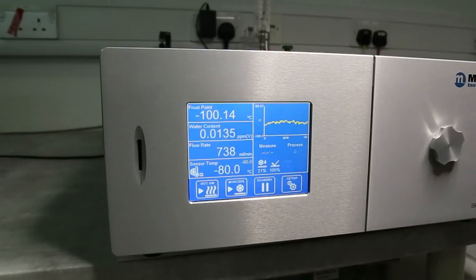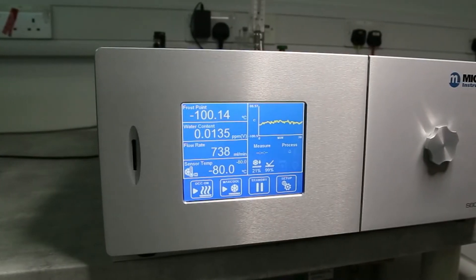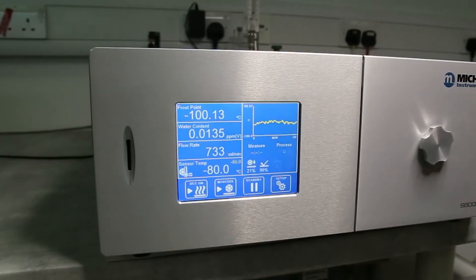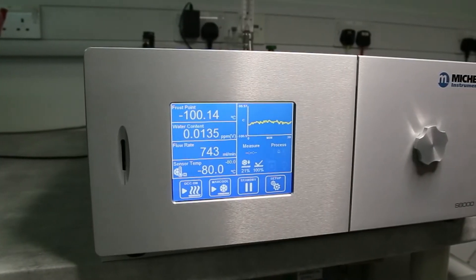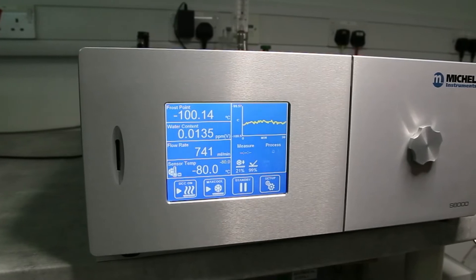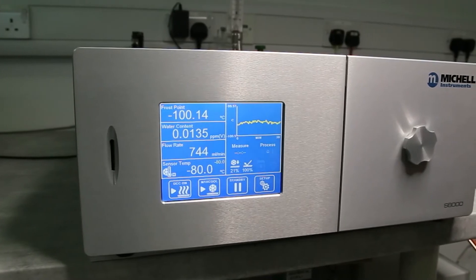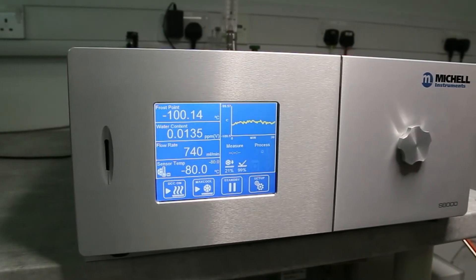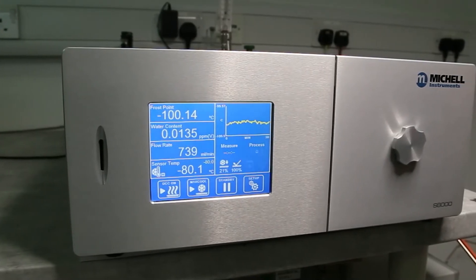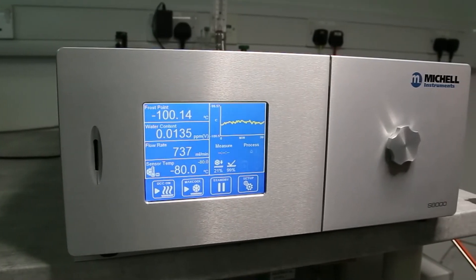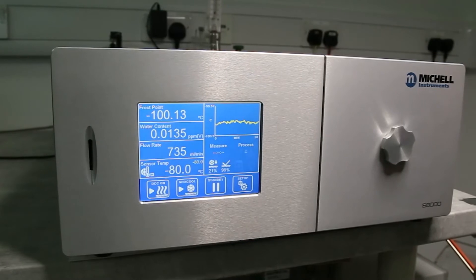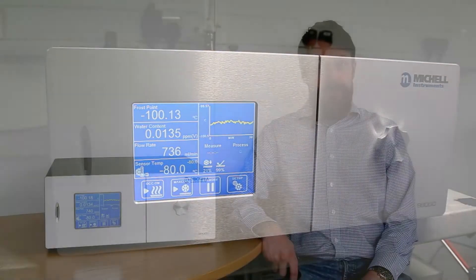The improved control system also simplifies operation for the user. The S8000-100 offers a completely automated operating mode, which requires the user only to set the flow rate correctly and purge the instrument for a sufficient length of time before pressing the measure button. The instrument will then determine the correct cooler temperature and begin measuring.